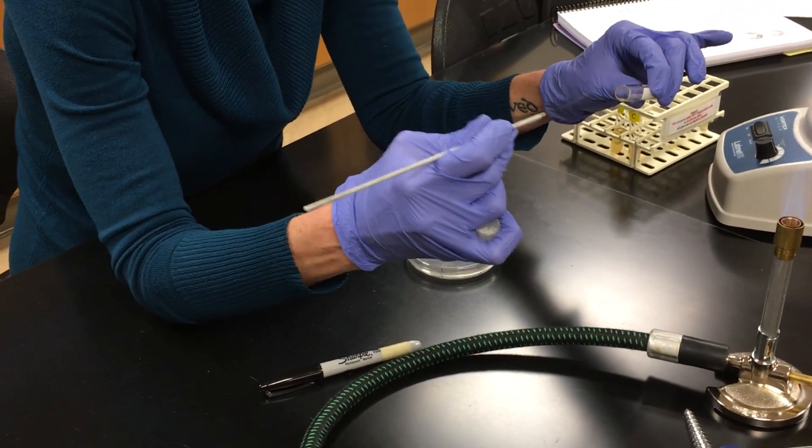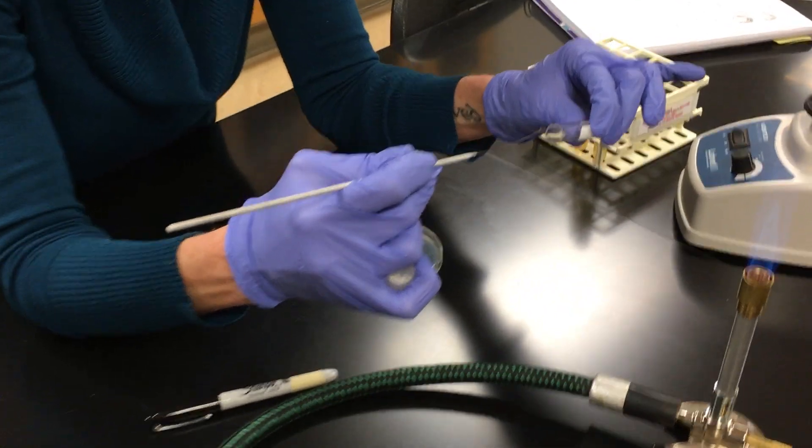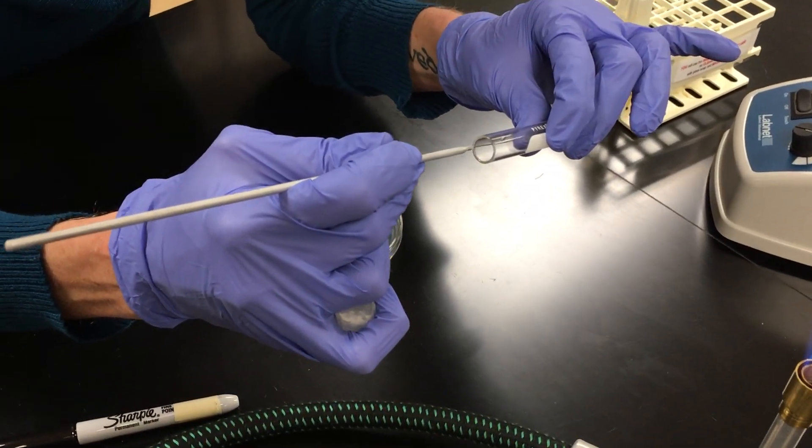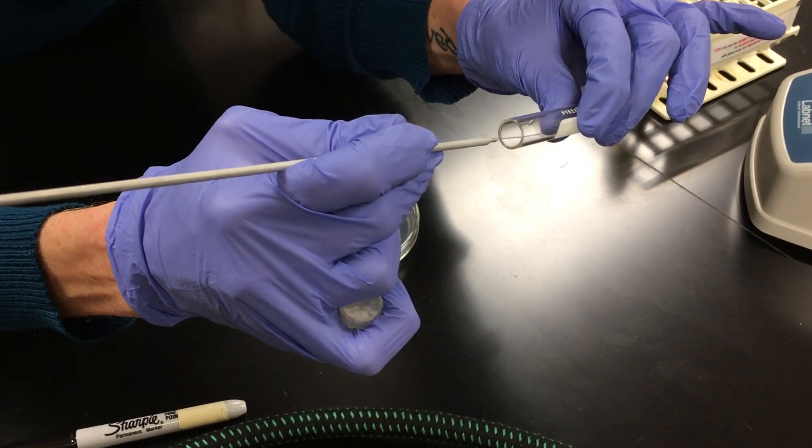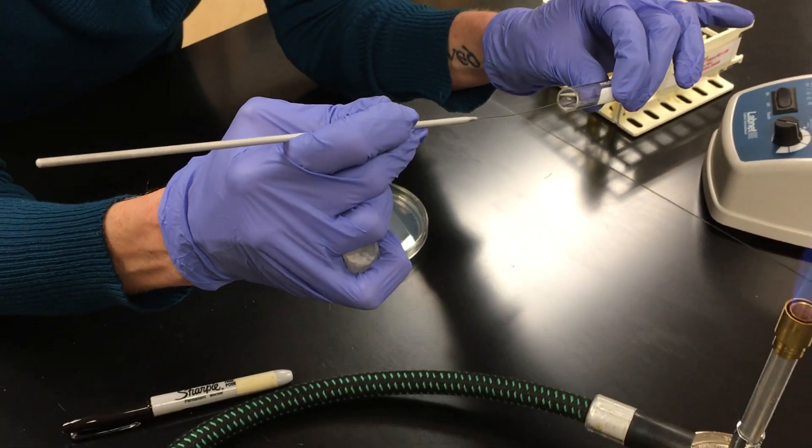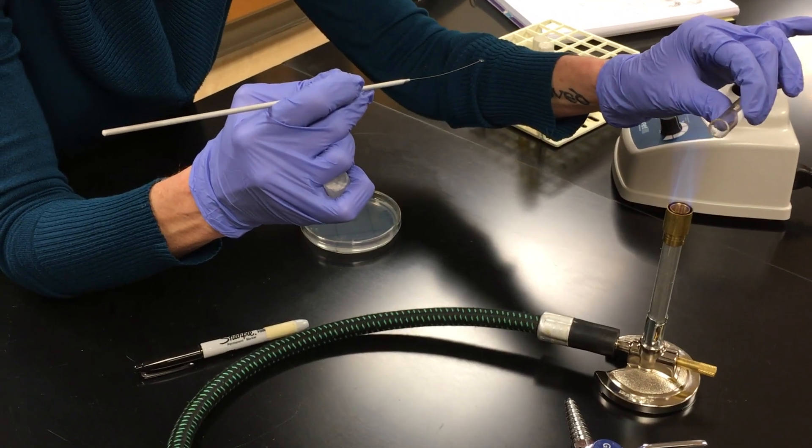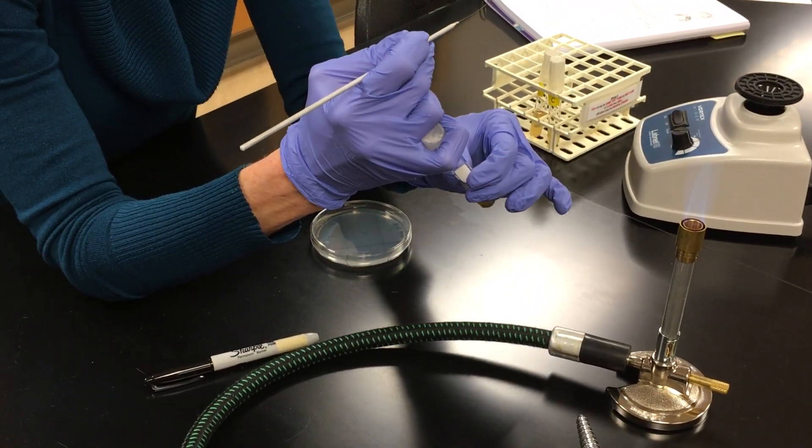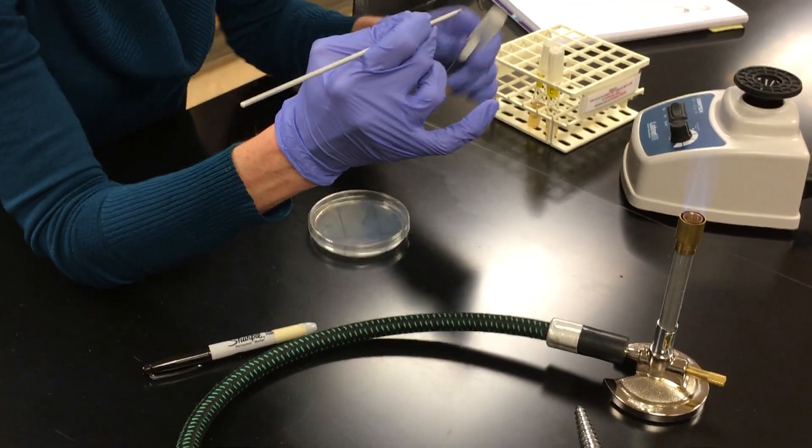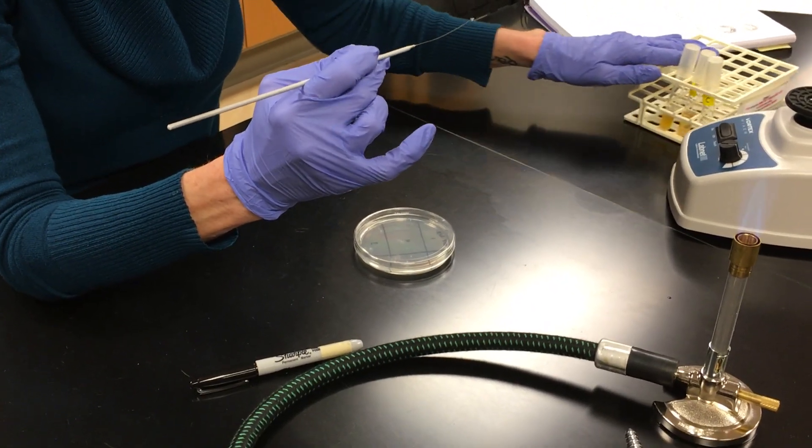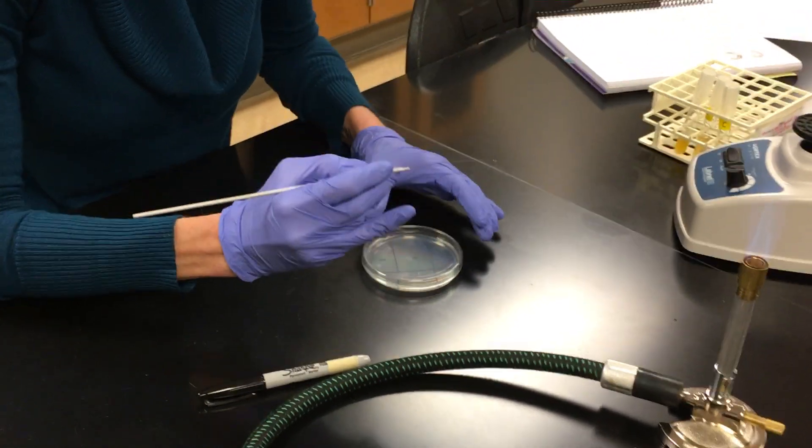And what you want to do is you want to put the loop of the needle into the culture without touching the sides of the tube. And you want to get yourself a loop full of culture. So I have a loop full. And now I'm going to reflame the culture tube. And then I'm going to put the cap back on. I'm going to put it in the test tube rack. And I'm going to move this away, because I'm never going to go back into that again.